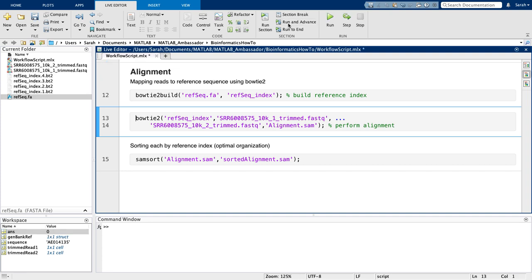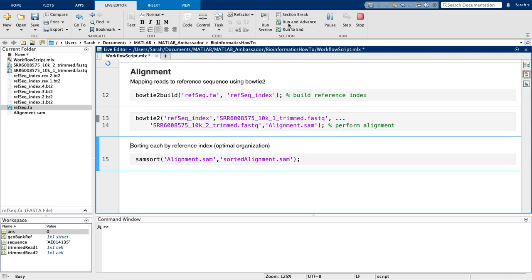After the alignment, I will sort my SAM file by the reference index of the alignment, as this increases computational performance.